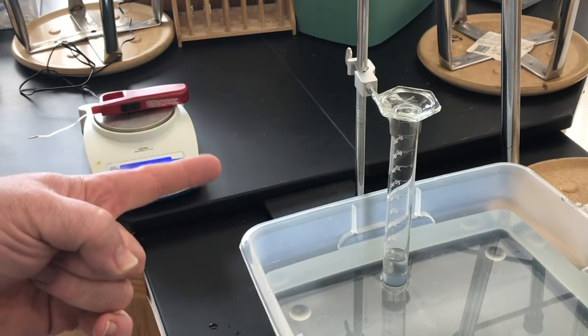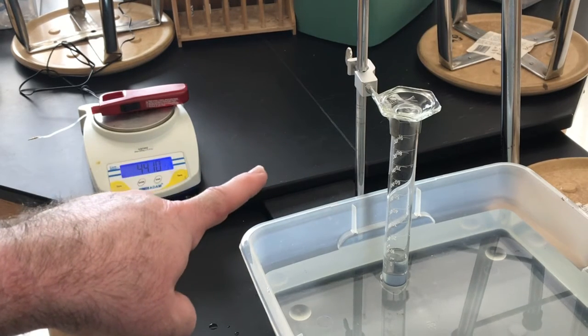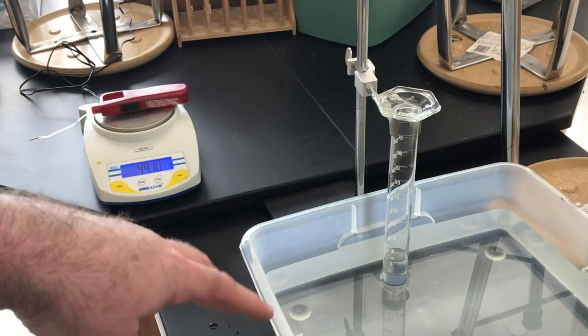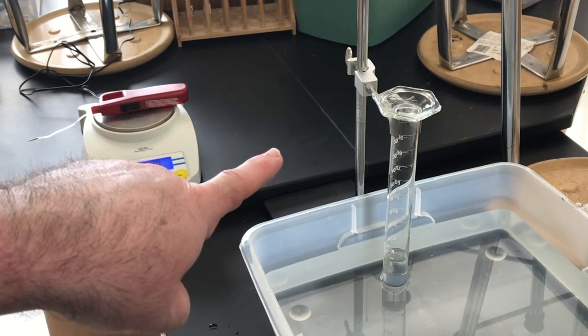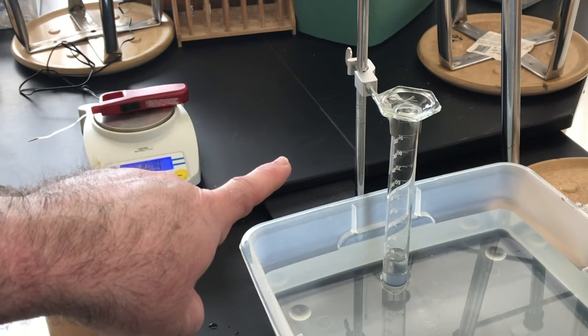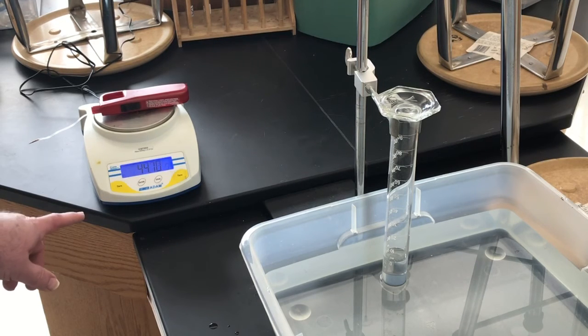Okay, now we should be able to do our calculations based on pressure. The atmospheric pressure should be equal to the pressure inside the graduated cylinder. The volume is 100 milliliters. And the temperature, well, I'll have to give you the temperature. I forgot to measure the temperature in the room, but I'll get that to you in just a bit. And we have the ideal gas constant, of course. We have to use the right one that matches our units here. We can use all of that and the ideal gas law to find the moles. And if we have the moles and the mass of the butane, then we can calculate the molar mass of butane. Looks like it's dropped, oh, no, 44.10 is our final mass there.